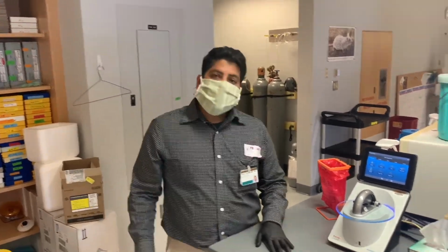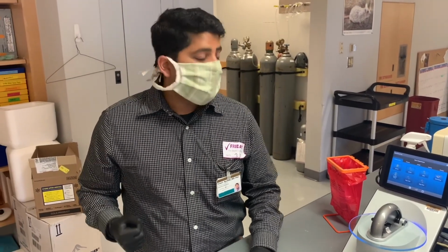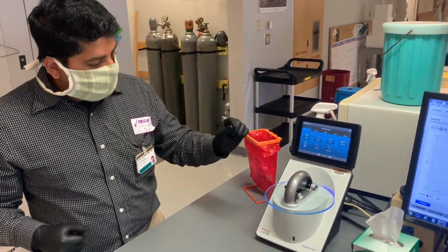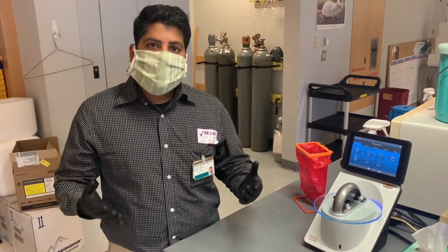So, when we're working with DNA and RNA, we have to have a way to measure the amount of it. We do that using this small machine here that allows us to measure very, very small amounts of DNA and RNA.